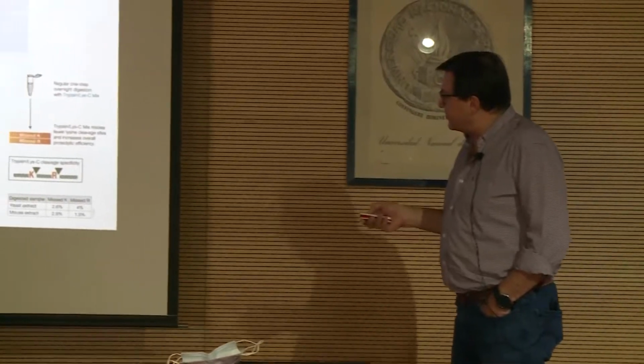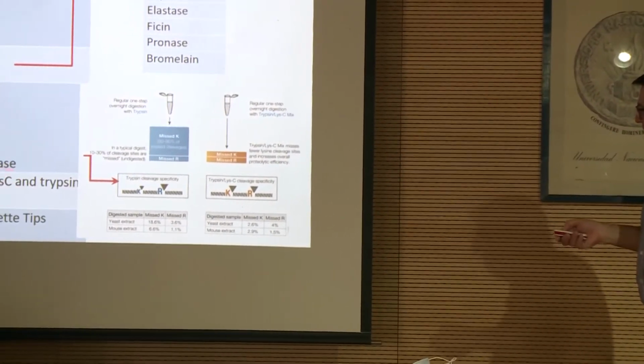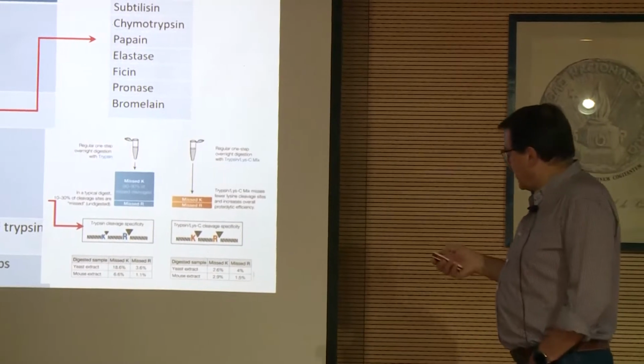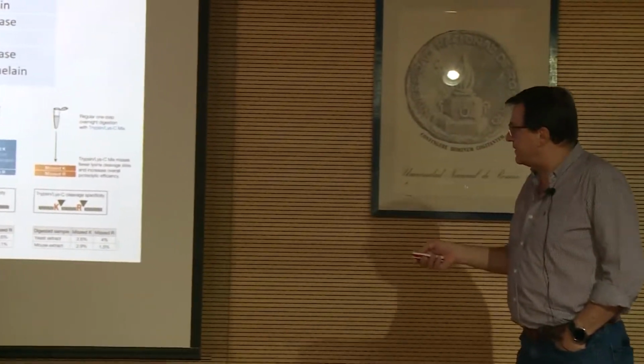So it's good advice to use Lys-C first, which has the same specificity for lysine with or without proline following, and then use trypsin.